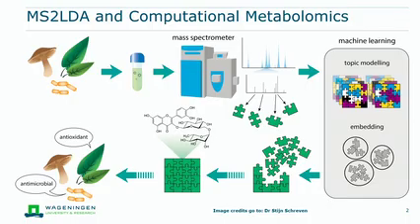And if we consider all the peaks you get as pieces of the puzzle, then topic modeling can help to find how these pieces fit together in slightly larger blobs to make the final puzzle, to get to your metabolite structure more easily. And in the end, and that's also what we're working on together with Jonas and Rosina, to help you to also connect even functions to your molecules.